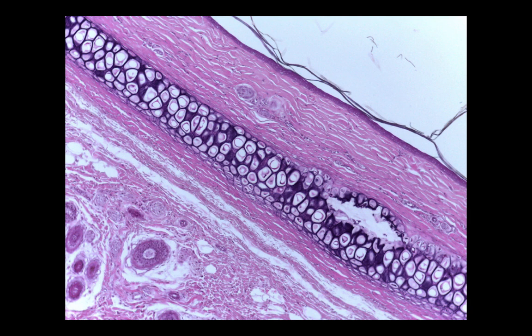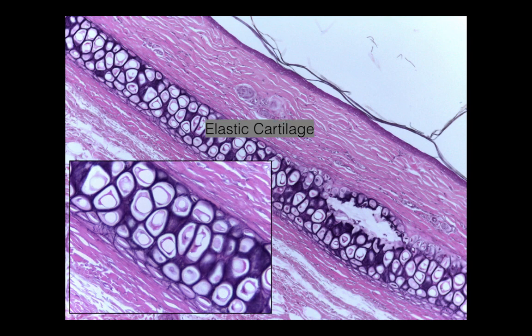This slide shows elastic cartilage. It looks similar to hyaline cartilage except you can actually see those elastic fibers in here. Elastic fibers almost always stain black or dark blue-purple.